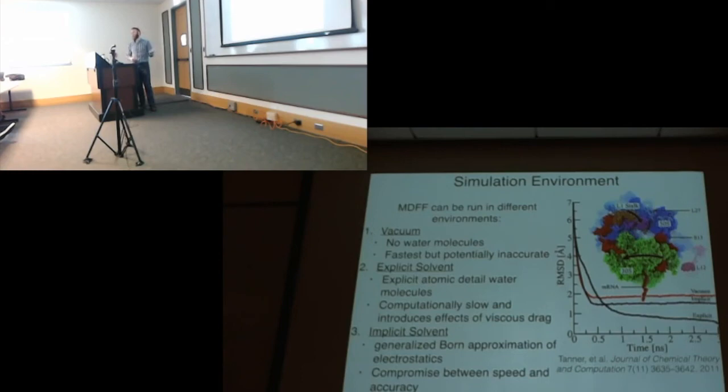So if you're adding those forces in onto your side chains in your simulation, you're already getting the benefit of the high resolution maps. Now, the high resolution maps pose their own issues for this type of methodology, because you have these very sharp potential wells. Your map is very well defined, and so this method can get stuck in some of those local minima where it's not supposed to go. And so we recently have some new variations of this workflow to overcome some of those issues. I'm not going to go into that today, but if you're curious, you can ask.